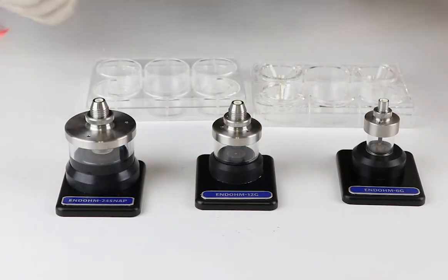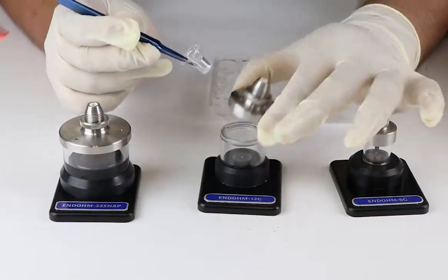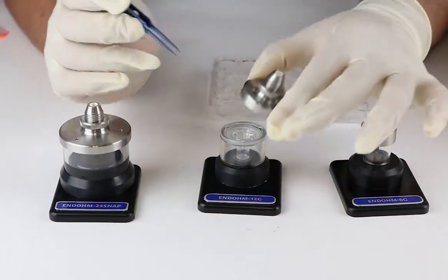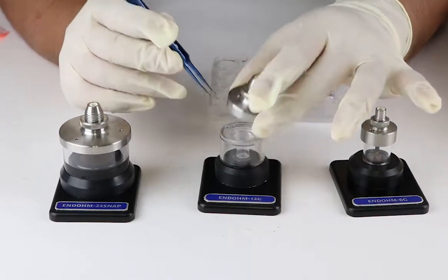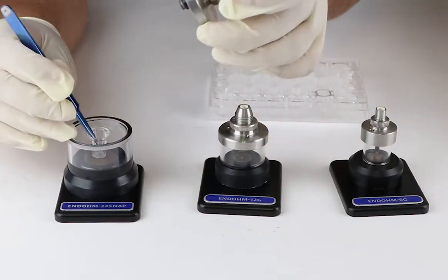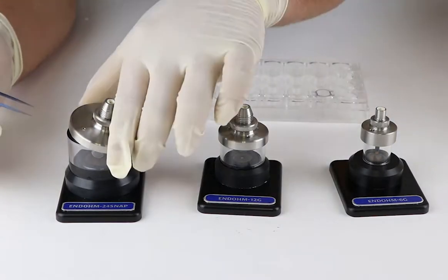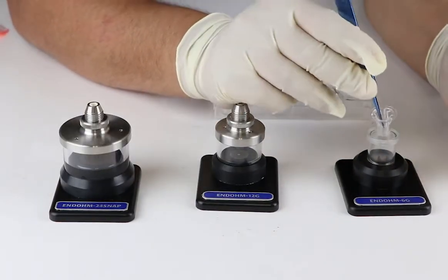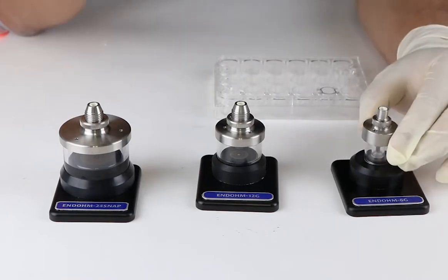This 6 well plate insert can be used with EndOhm 24 Snap. Similarly, if you try to use a 24 well hanging insert with EndOhm 12G or EndOhm 24 Snap, it is not going to work, since the large diameter of the top electrode will prevent it from fitting into the insert. Therefore, this 24 well hanging insert can be used with EndOhm 6G.